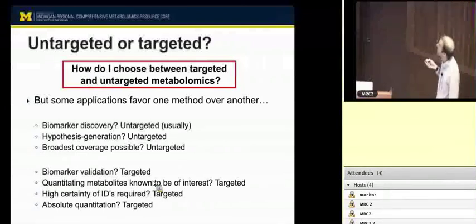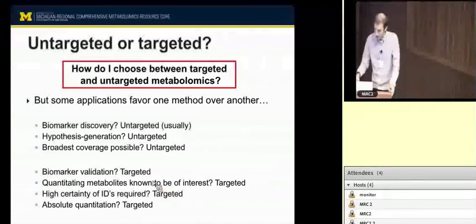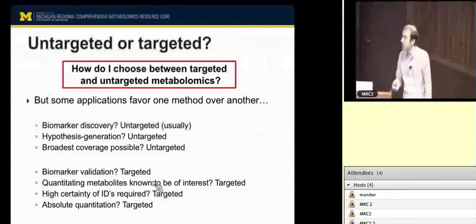The question is, do you need to be concerned about flux right from the get-go? Well, for a new project, I would say starting out trying to measure flux and concentration is often too much complexity. You may be better off starting with a targeted or untargeted conventional metabolomics workflow, the outcome of which will often inform whether you need to measure flux, whether you need to measure the turnover or not. But exceptions do exist. Sometimes we can tell right off the bat that you're going to need to have some study of flux, and we may start you out with that type of experiment.